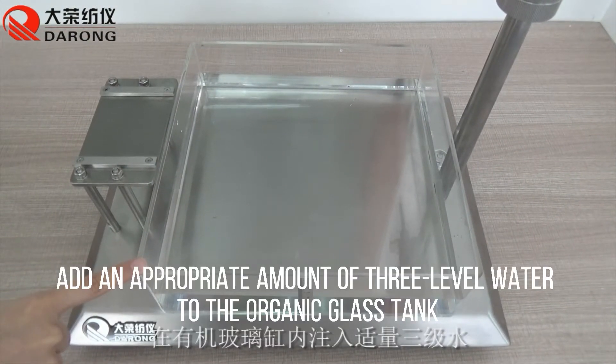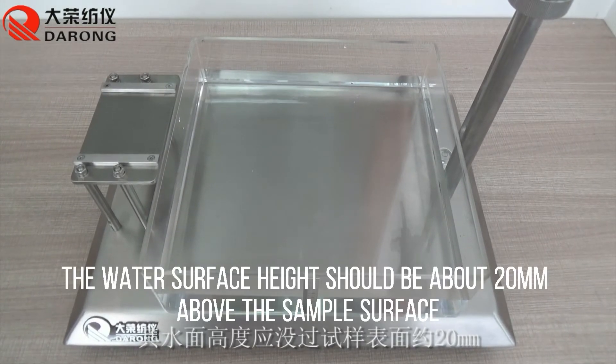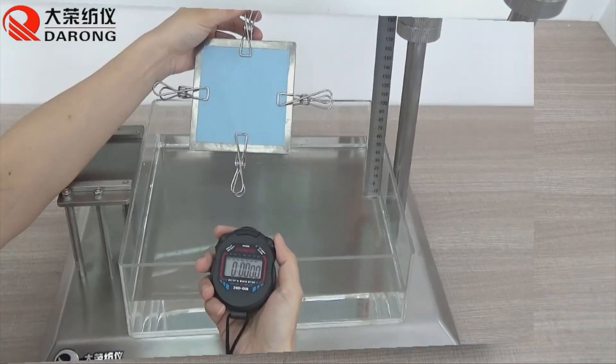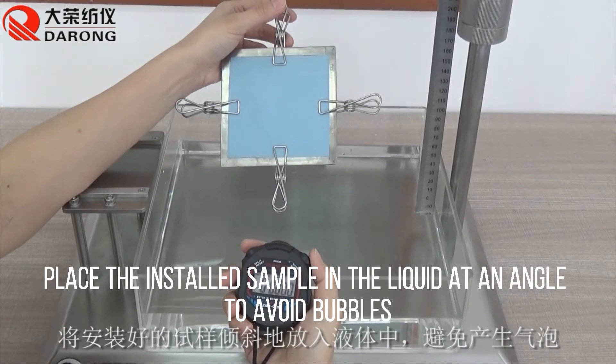Add an appropriate amount of 30°C water to the organic glass tank. The water surface height should be about 20mm above the sample surface. Place the installed sample into the liquid at an angle to avoid trapping bubbles.